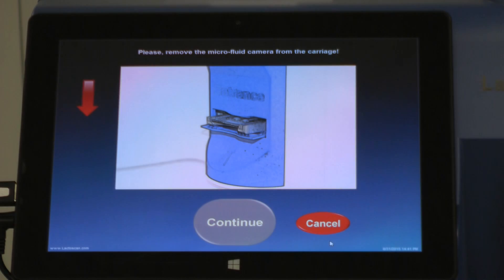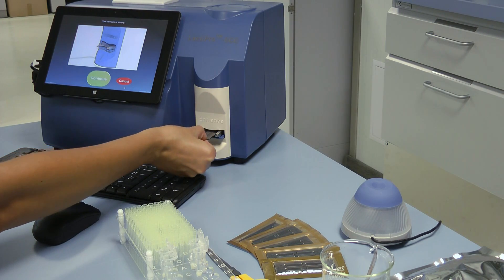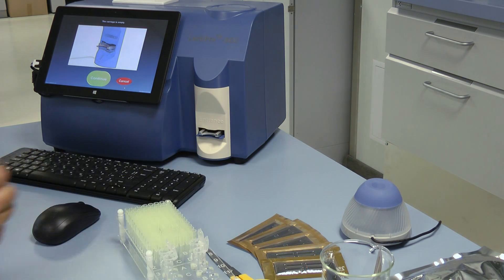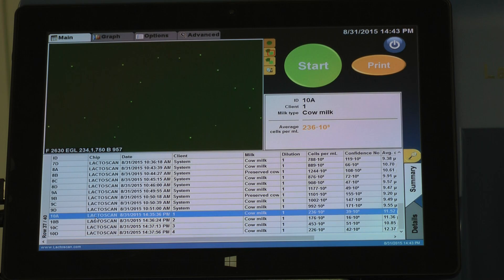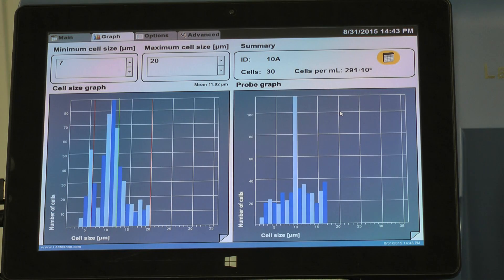A message is shown to remove the microfluidic camera from the carriage. Take the LactoChip out. To proceed back to the main screen, press Continue. Choose Display Graph from the screen options in order to see the test results on a graphical image. You can repeat the same procedure for all the samples.